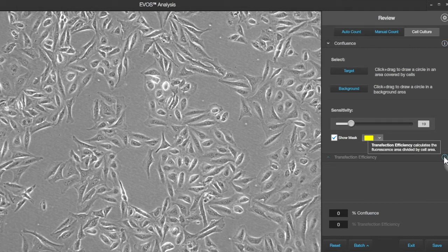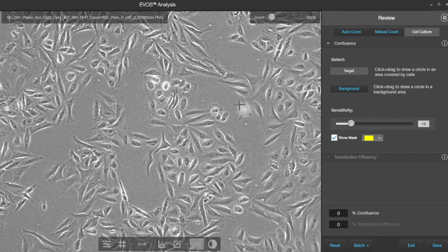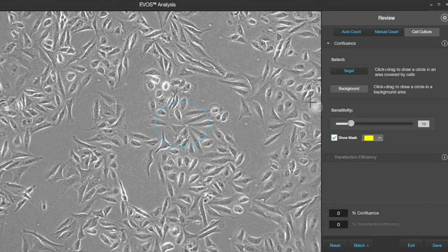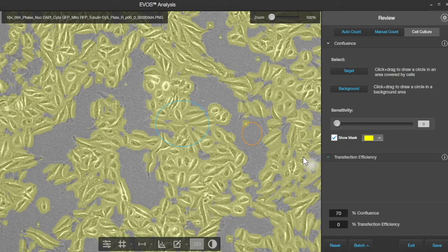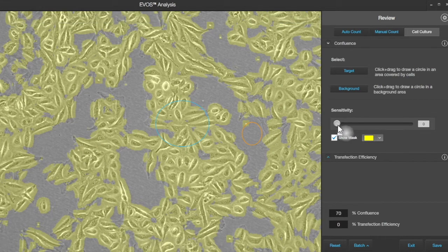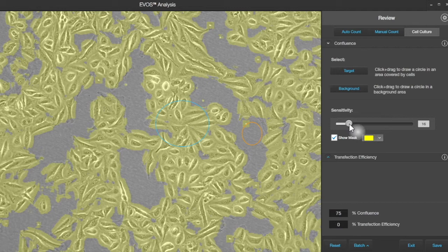Then we'll do our transfection efficiency, which will calculate the amount of fluorescence area within that cell area. Starting off with confluence, we select a target zone by clicking and dragging over an area that has cells in it, and then we create a background by dragging in an area that's open. We can increase the sensitivity and expand it a little bit to fill in some areas that are missing. And that looks pretty good.